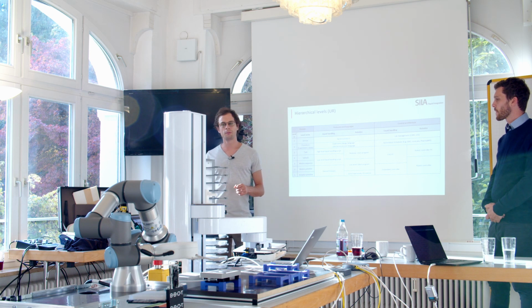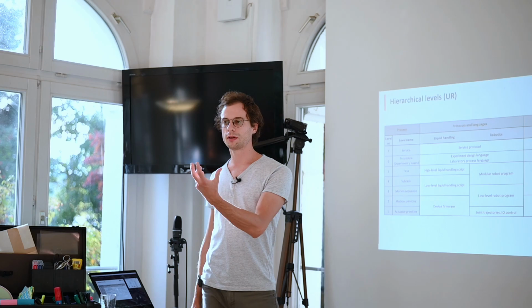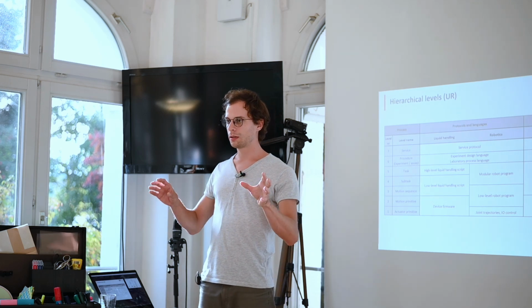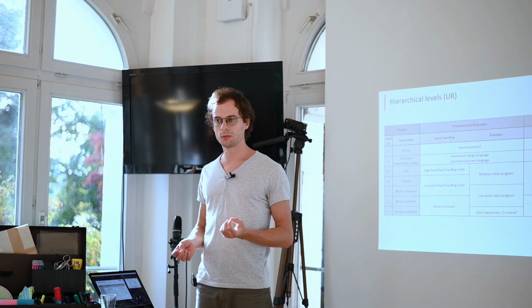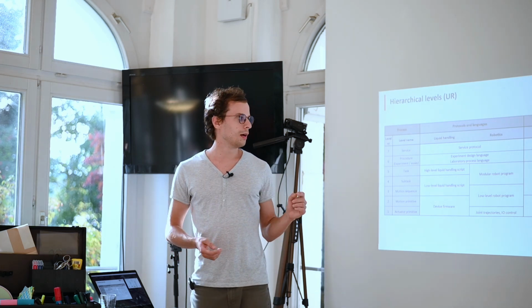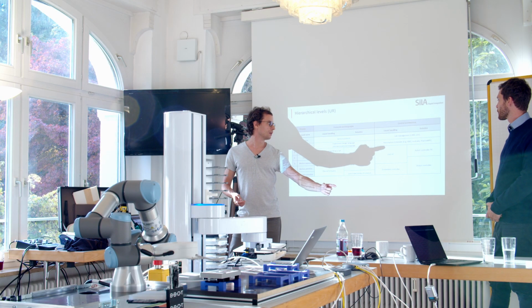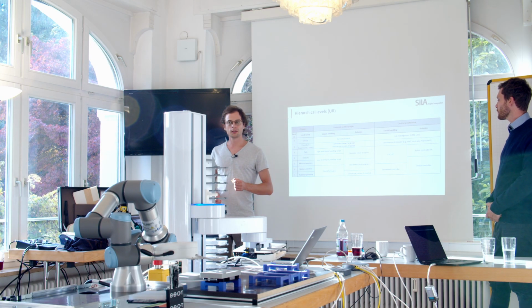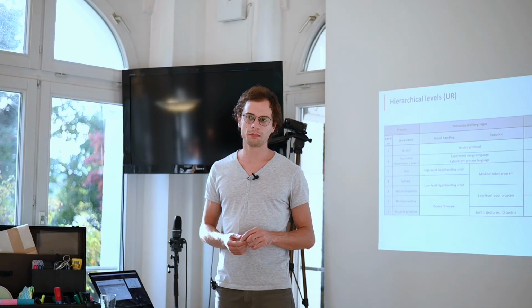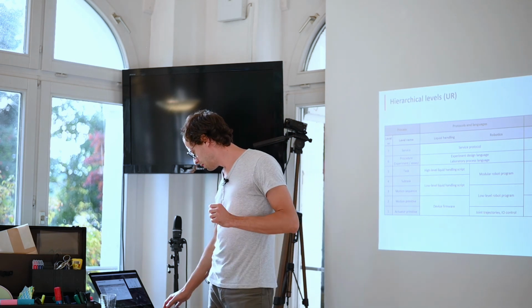So they were programmed, they were taught directly on the robot controller level. So with that, we cover basically the two approaches, how robots can be integrated with SiLA and controlled by a high-level scheduler. The scheduler was implemented by Stefan, which controlled both of the robots.